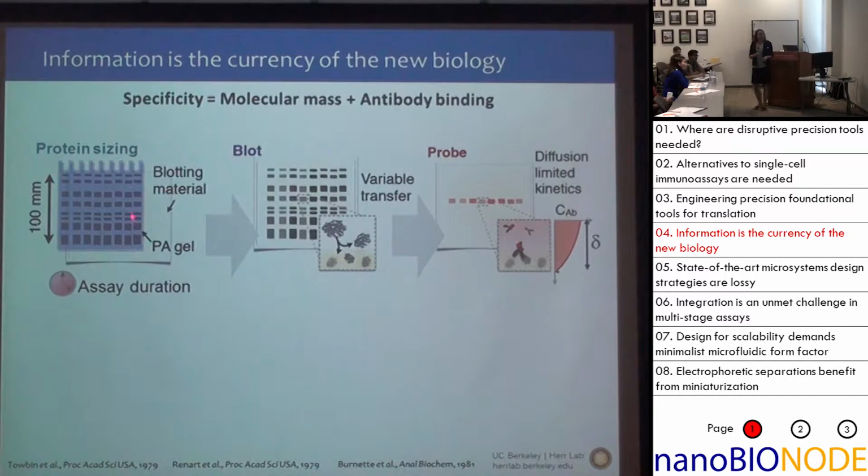After we do that, oftentimes we take those resolved protein bands from each sample and print them, if you will, what we call blot them, onto a hydrophobic membrane. So we're basically moving sample, now fractionated, from this very small pore size polymer into a membrane that has very large pore size and can hold the material on it through hydrophobic interactions. So that's what this little image is here. We've moved protein from the gel into this hydrophobic polymer right here.